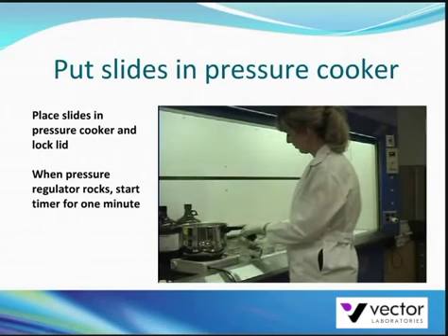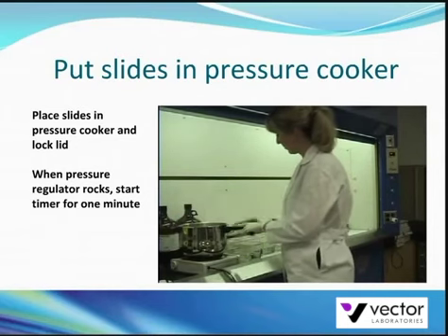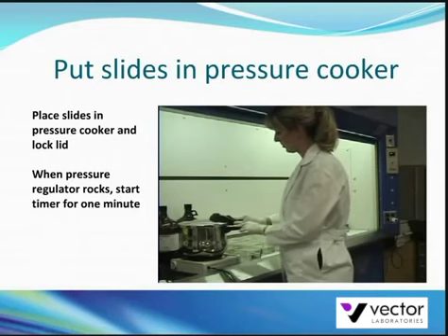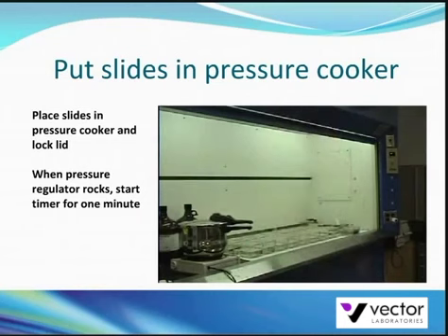As the internal pressure rises, the air vent cover lock and overpressure plug will rise. As soon as the pressure regulator begins to rock gently, start the timer. After 1 minute, remove the pressure cooker from the heat source and run it under cold water.